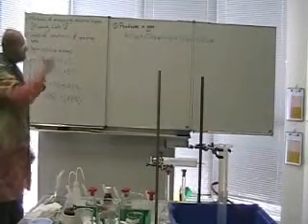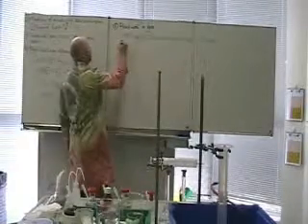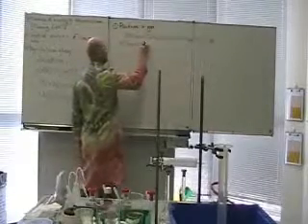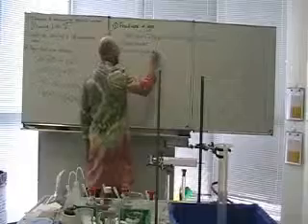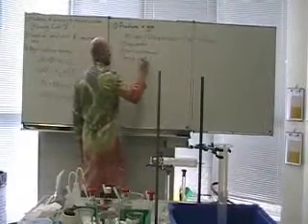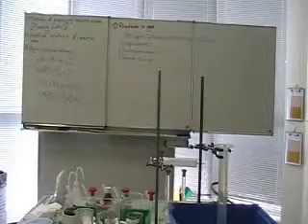And you can measure this in at least two ways. You can measure it using displacement. You can measure it using direct measurement. You can measure it using pressure change. And of course, there's your vacuum pump.